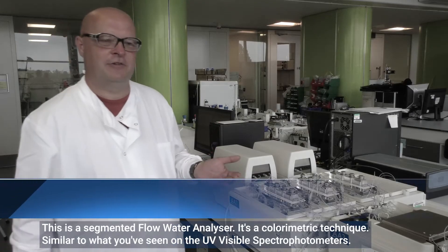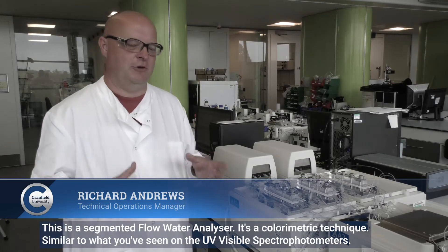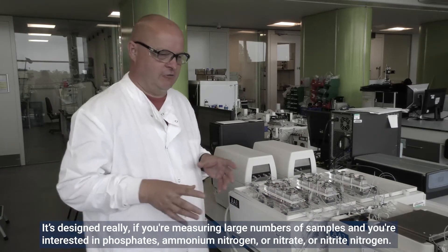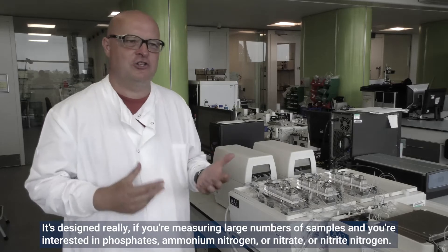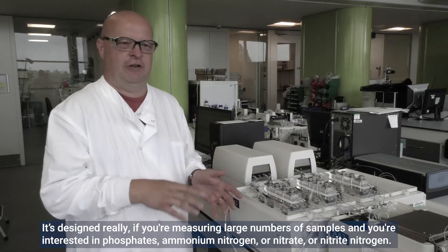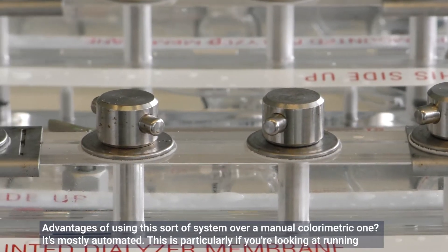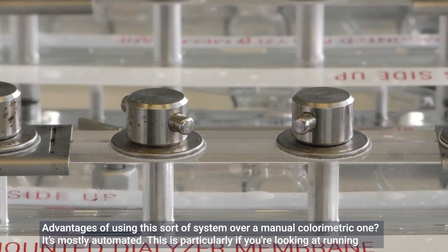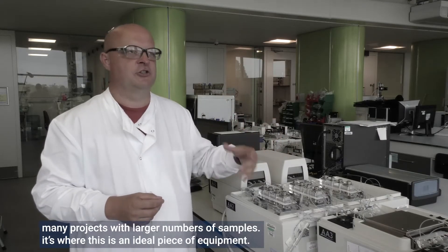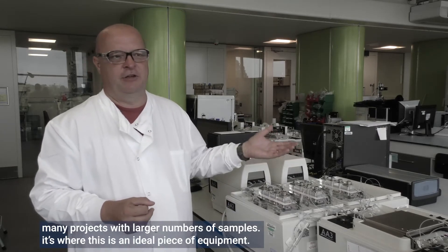This is a segmented flow autoanalyzer. It's a colorimetric technique, similar to what you may have seen on the UV-Vis spectrophotometer. It's designed really for measuring large numbers of samples where you're interested in phosphate, ammonium nitrogen, or nitrate or nitrite nitrogen. An advantage of this system over a standard colorimetric one is that it's mostly automated — it's ideal for larger projects with larger numbers of samples.